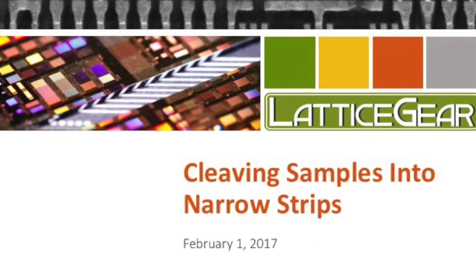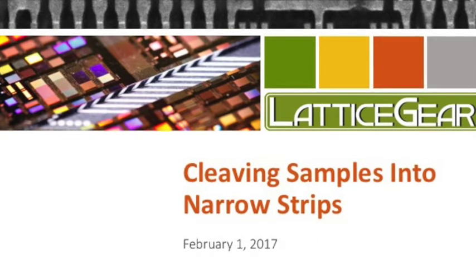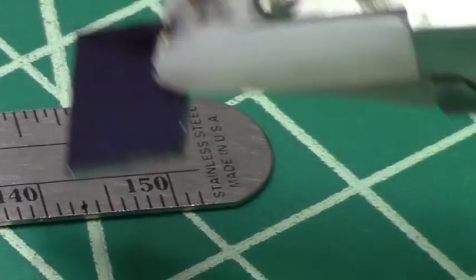In this first example, we're using a short scribe prior to cleaving. Listen for the click. That's the sample cleaving.